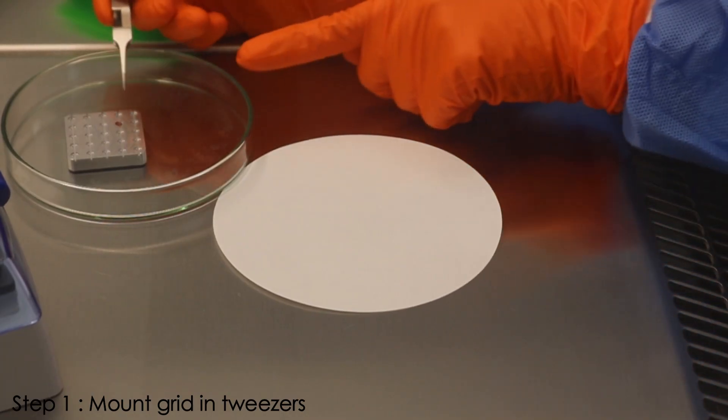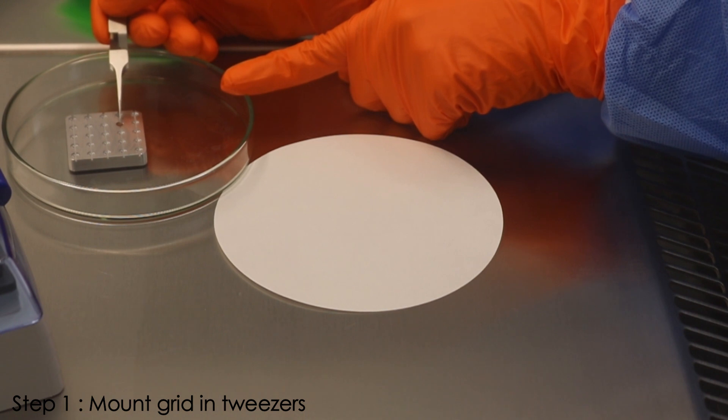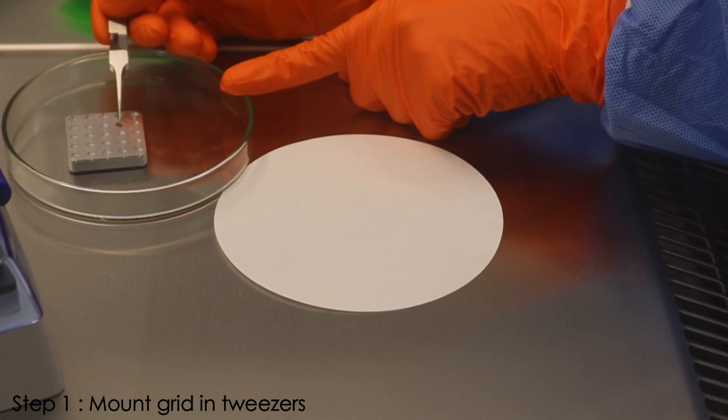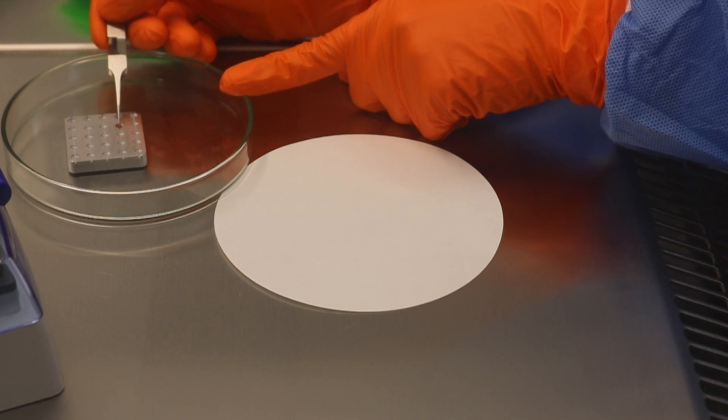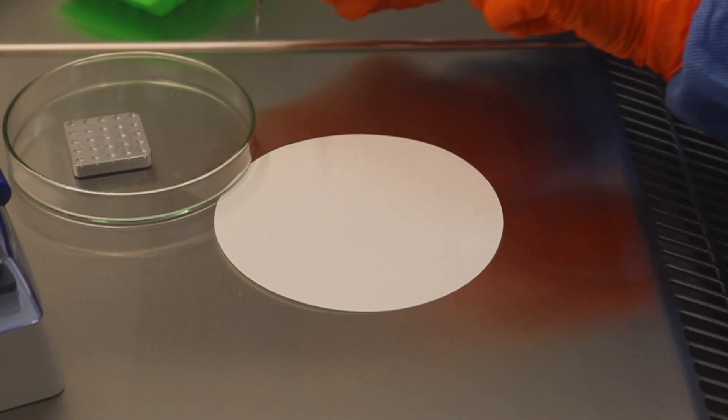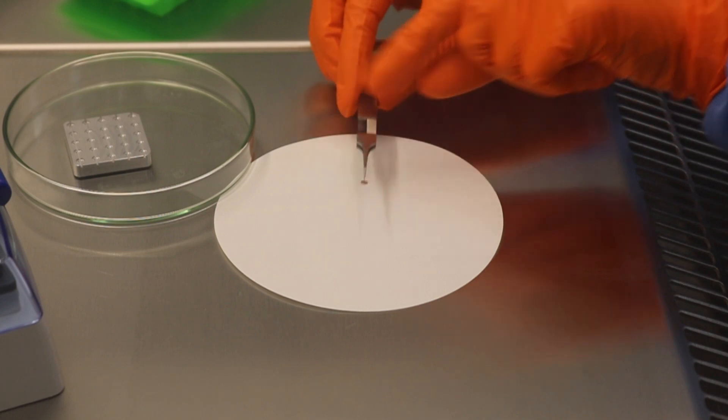First, pick up the grid by the edge, avoiding the mesh area. Mount a hydrophilized grid onto the inverted tweezers. This enables the grid to be stable during the entire procedure. Be sure the carbon side of the grid is facing up.